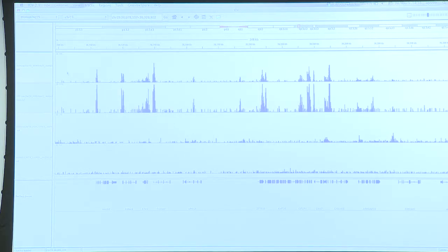Again, the idea is that we took raw reads from the server, we aligned them to the genome, we made some file that we can read, which I'll show you in a second how it looks on the Unix server, and then we've made BAM files that are easy for the machines to use, and then we used one of the tools in IGV to make it something that you can very easily visualize.